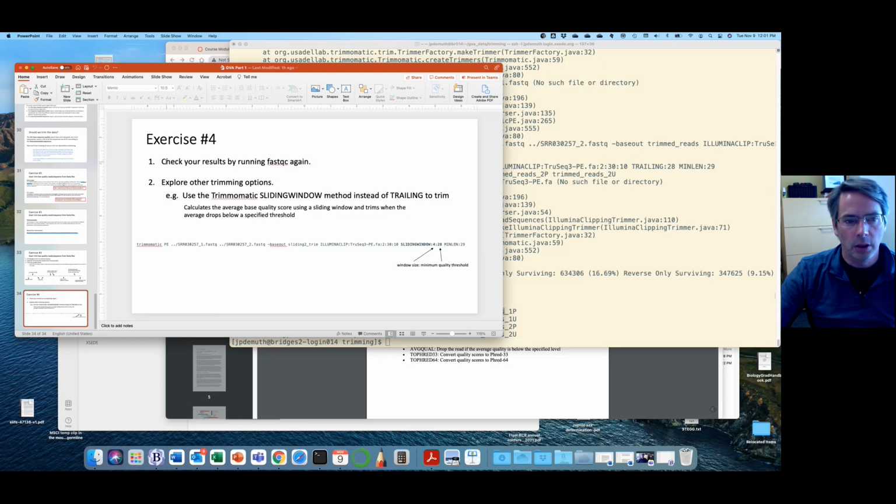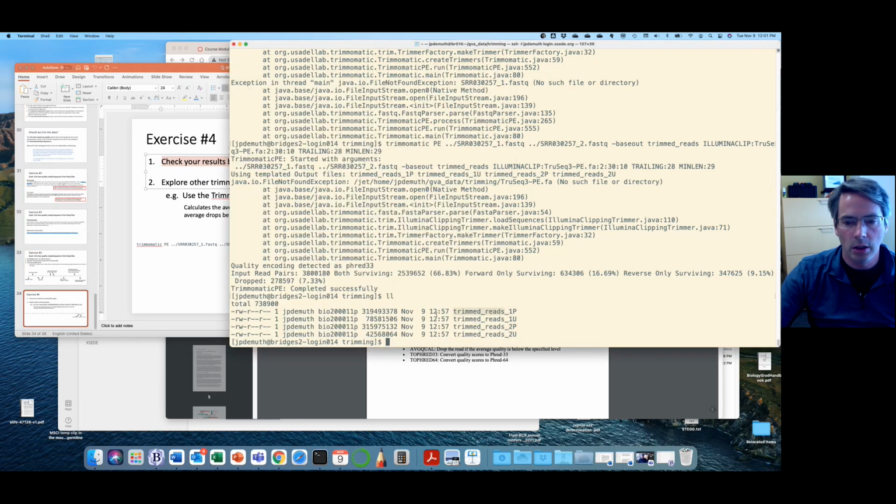All right. So last things, I'm going to turn you loose to do these on your own. You should run FastQC on these reads. So FastQC trimmed reads 1p.